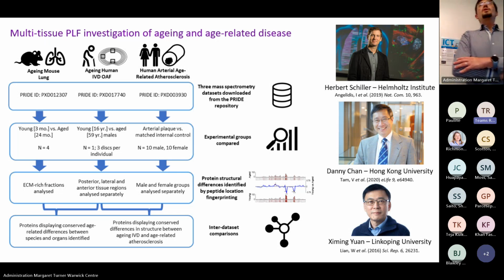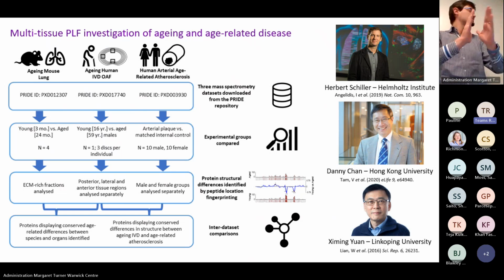And so they all had these really nice proteomic data sets that we could probe using this screening tool in order to try and find structure-associated changes in proteins that were age-related and maybe even associated or correlative between these different tissues.